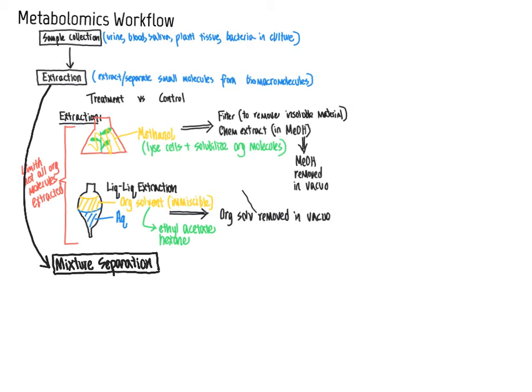And so the two main techniques that are applied for the separation of complex mixtures are liquid chromatography, specifically HPLC, high performance or high pressure liquid chromatography, which is generally in these workflows just referred to as LC for liquid chromatography to shorten that up a bit.